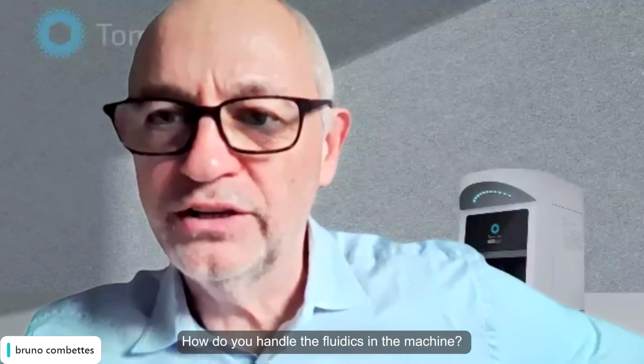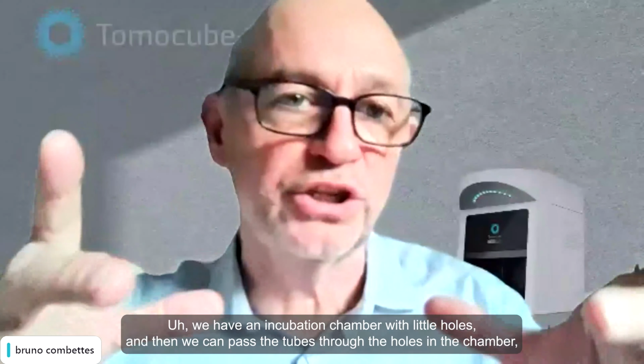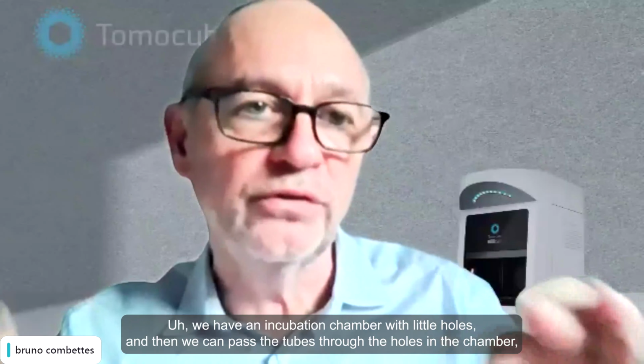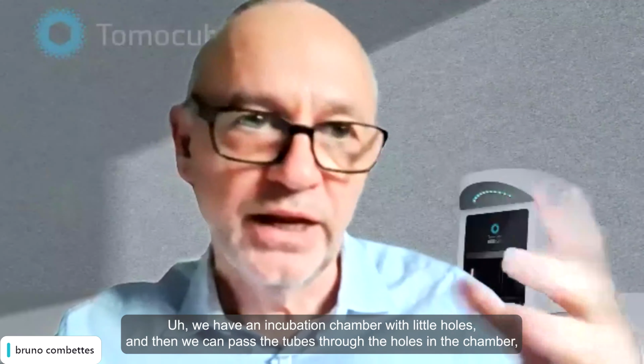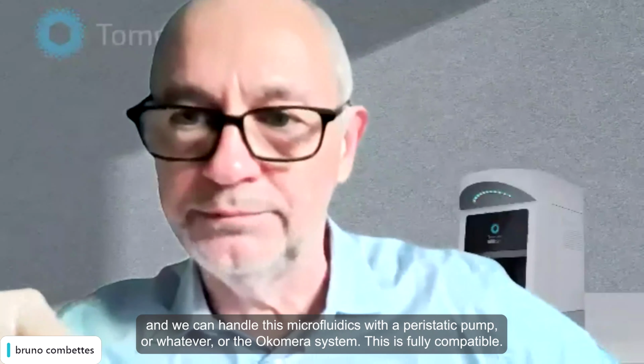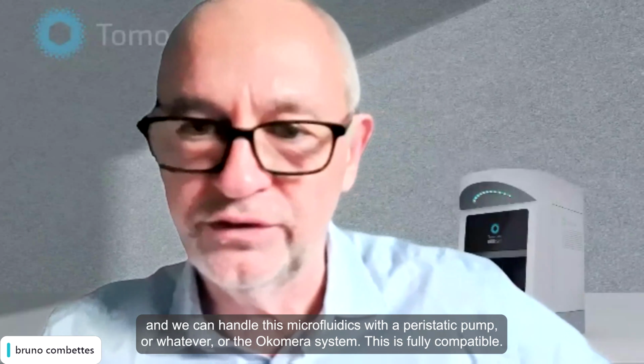Okay, so we try to give quicker answers because now questions are coming. We're snowed under. How do you handle the fluidics in the machine? We have an incubation chamber with little holes, and we can pass the tubes through the holes in the chamber, and we can handle this microfluidics with a peristaltic pump or whatever, or the Okomera system.